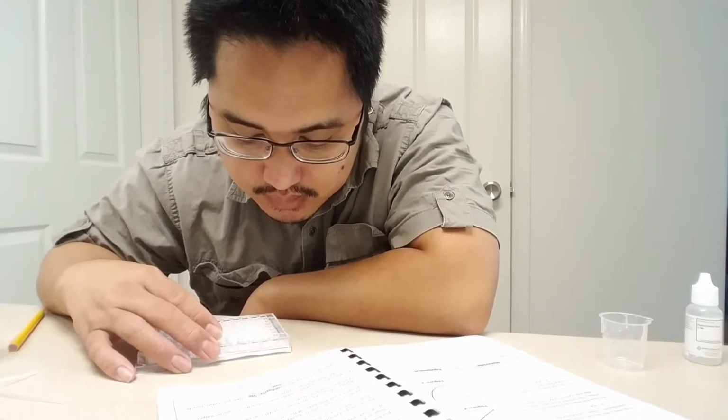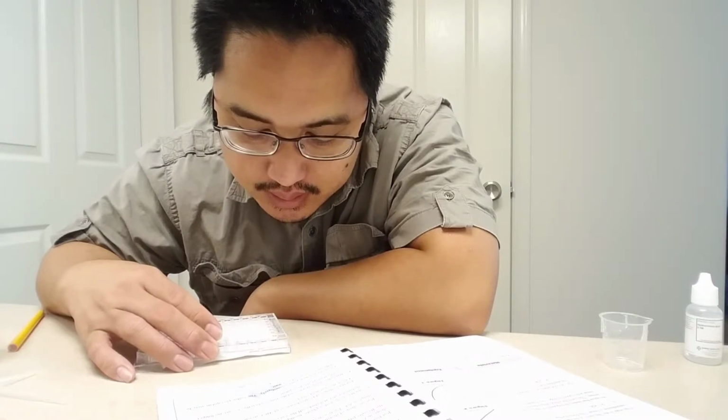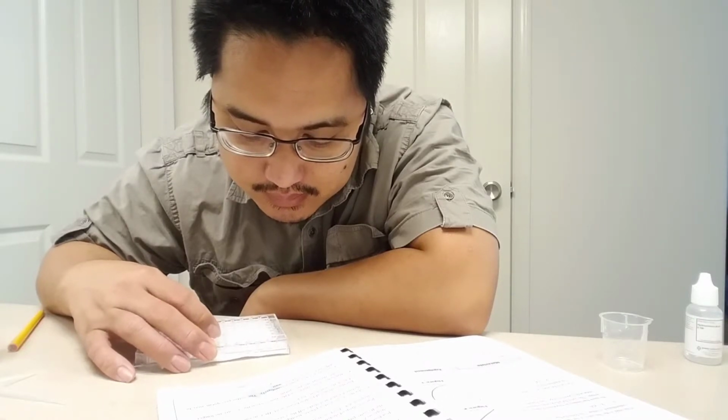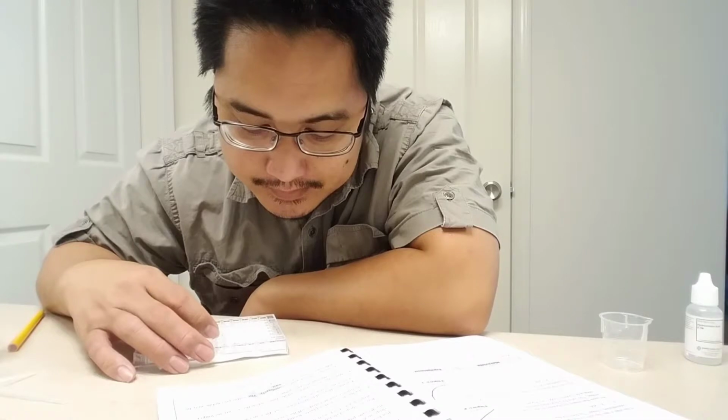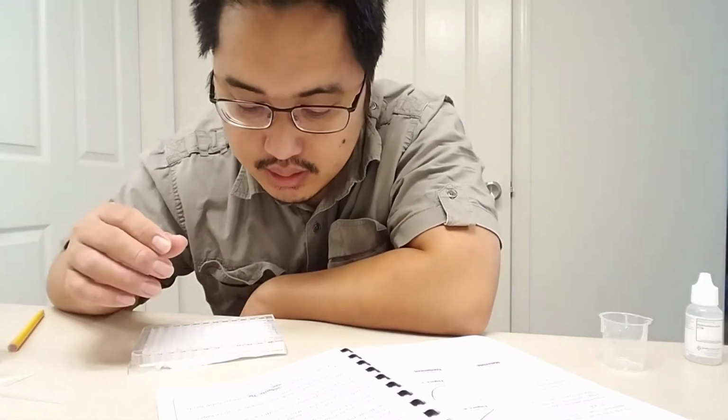Okay, is it turning? Oh, it's starting to be hard to see that first X. I can tell you that. And I keep shaking it, and I realize what I'm doing is introducing another variable. And this is good because this is the first time I'm doing this specific experiment, and I can show you some pitfalls. I wouldn't shake it, or maybe I would shake it the whole time. I'm just trying to shake it just to see if it will actually turn cloudy in the first place.